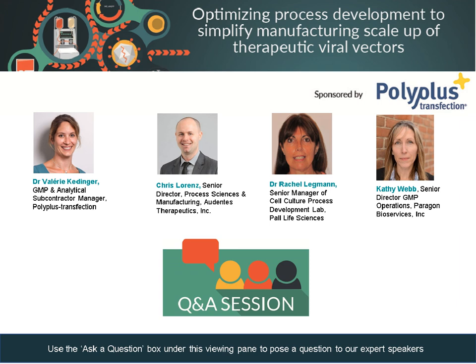Sure. Yeah. In short, yes, we have. We have looked at that. Candidly, not so much looking at transfection efficiency, more in terms of trying to look at optimizing the cell culture media itself and any sort of feeds that we may be considering to help increase cell growth, cell viability, and ultimately to have more cells, which means more hosts to make our AAV vector in.